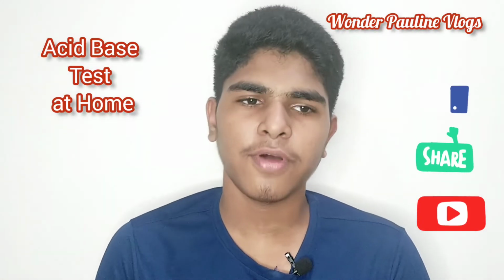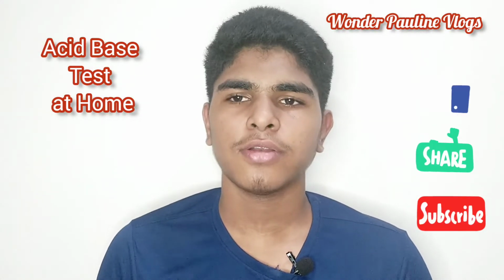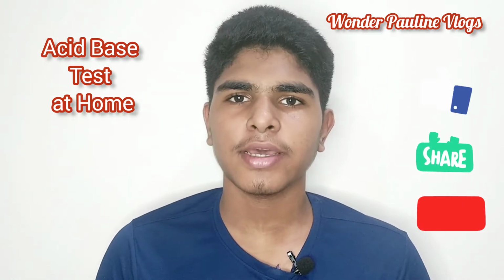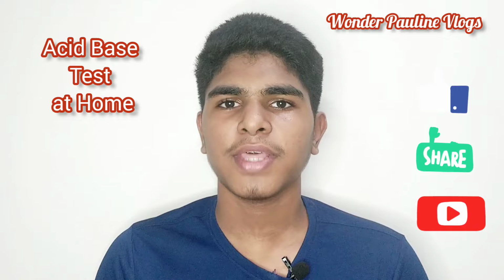Today I will be performing an activity based on indicators. For today I have taken hibiscus as the indicator. Now let us perform the activity.